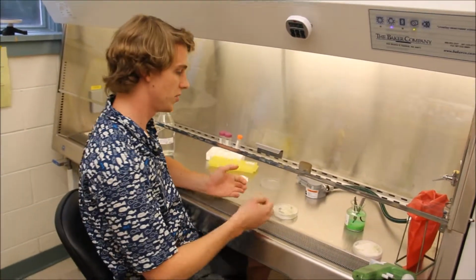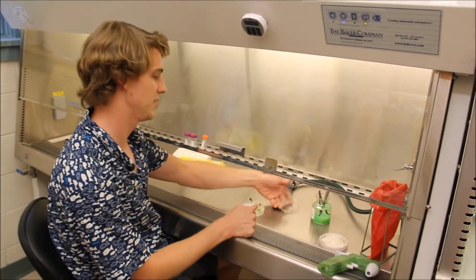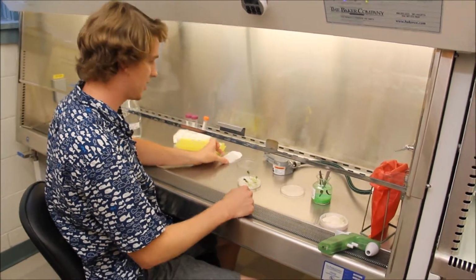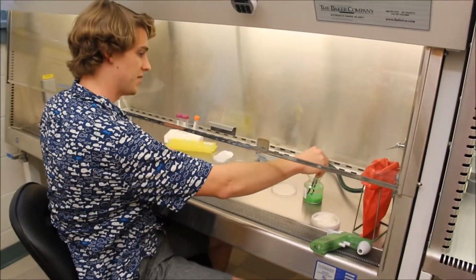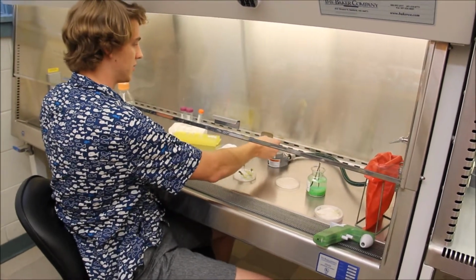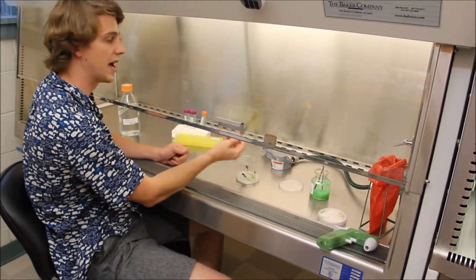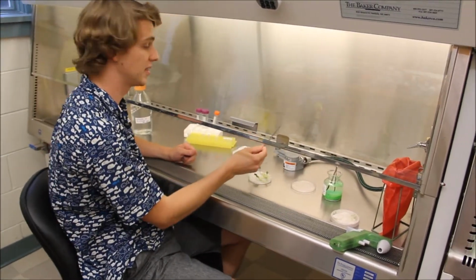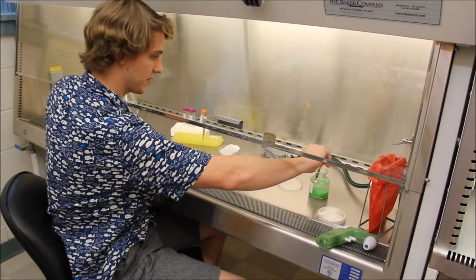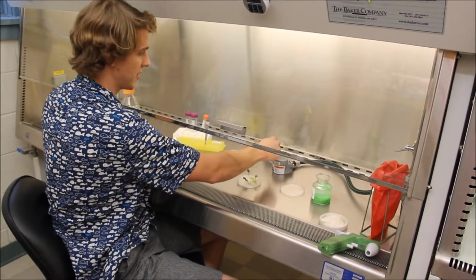So once your filter paper is wet with germination and co-cultivation medium, or 1/2 MS plus acetosyringone, you're ready to actually do the process of transforming one soybean seed to become a hairy root culture. For this process, you need to sterilize your tools again. We'll be using a scalpel. And this is what we're going to be dipping into the Agrobacterium and making the actual cuts. And you need some forceps so you can hold on to the bean and remove certain parts of it.